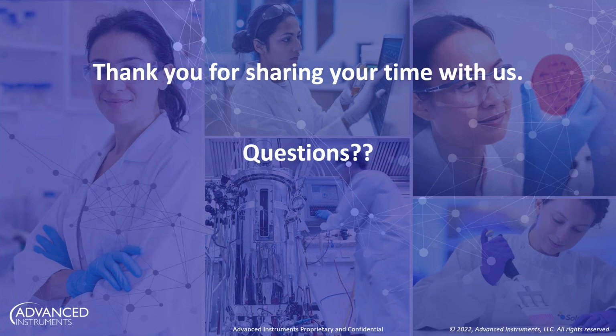Thanks, Shweta. Looks like we have a few questions. The first question is, we are still paper-based with our osmometer. What would be the best way to transition?